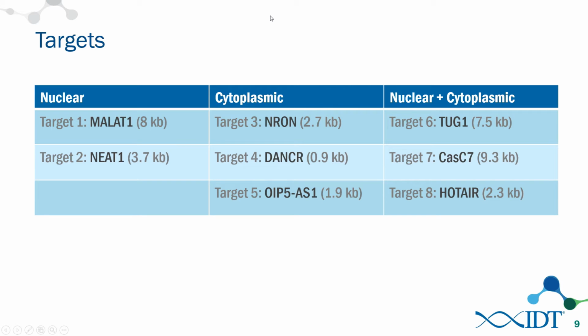Let's see here. This is an interesting question. Do you observe any correlation in the amount of knockdown that you get and the basal level of expression that you started with? Sometimes. If you remember NRON, which is our lowest expressing non-coding RNA, this is the one that we were unable to knock down. The first time that I presented this, there was another scientist at Stanford who approached me and said that in their lab they find it sometimes difficult to knock down long non-coding RNAs which have low abundance.